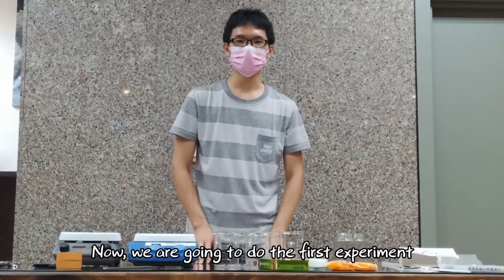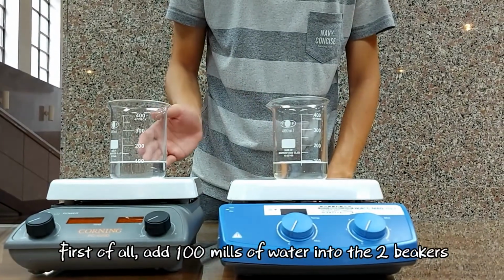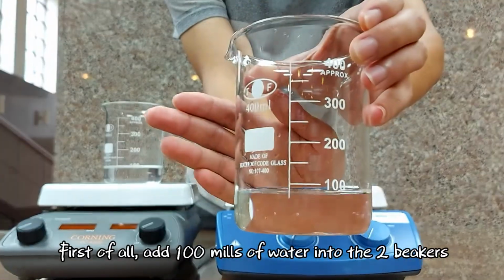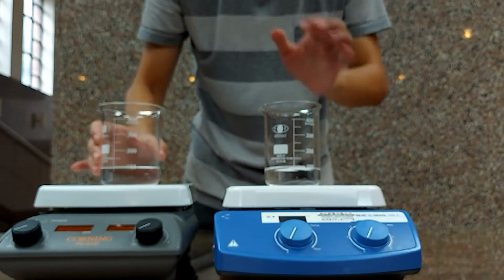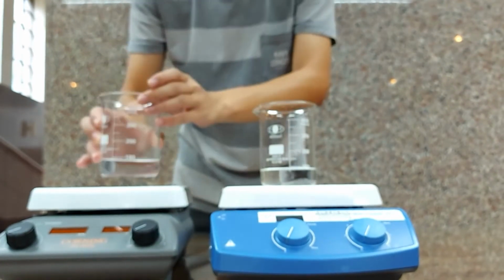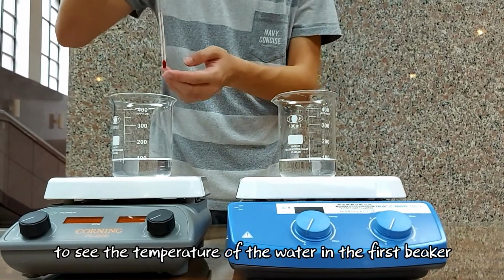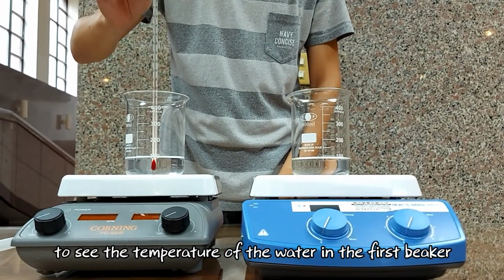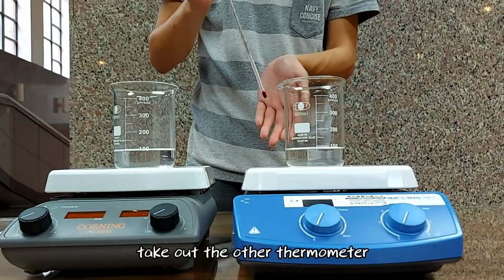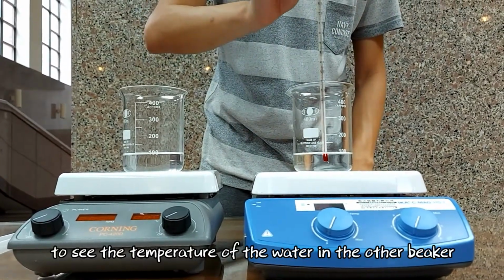Now we are going to do the first experiment. First of all, add 100 ml of water into the 2 beakers. Take out 1 thermometer to see the temperature of the water in the first beaker. Take out the other thermometer to see the temperature of the water in the other beaker.